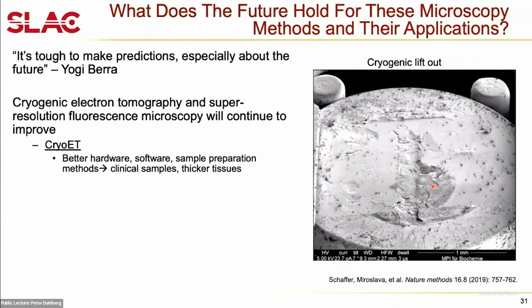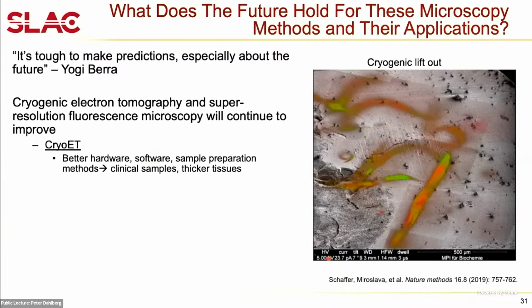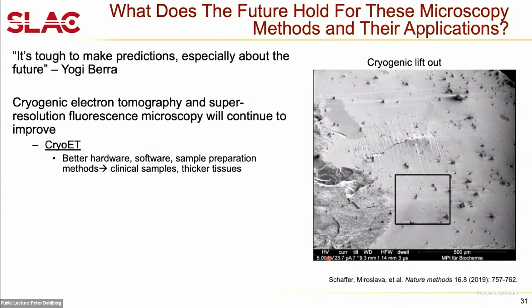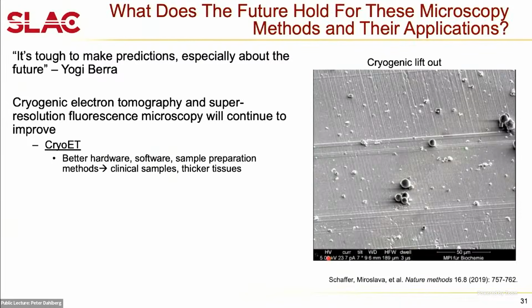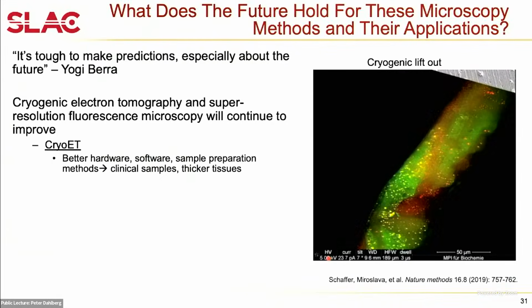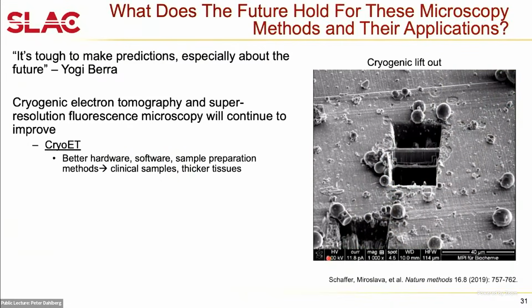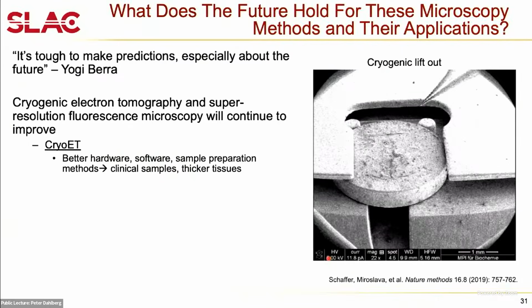And what we're going to do is go in and use one of these focused ion beam milling devices to extract a thin section from this thick sample. And that looks something like this. Here we'll see those fluorescently labeled worms, and we're using that fluorescence to guide this milling process. Using that fluorescence, we can figure out which section we want to take. And then we come in with that energetic beam of ions, which chips away at the surface and cuts it out like this. And now we have to extract that.